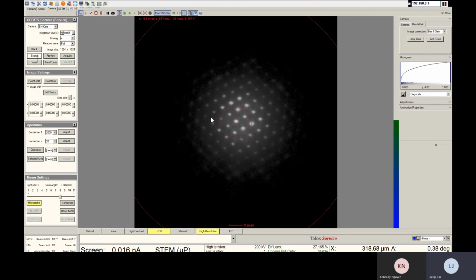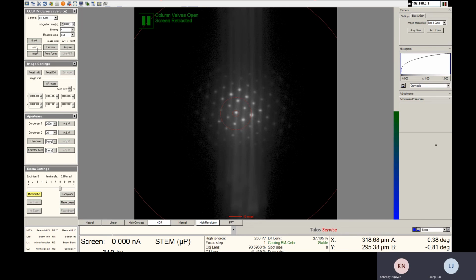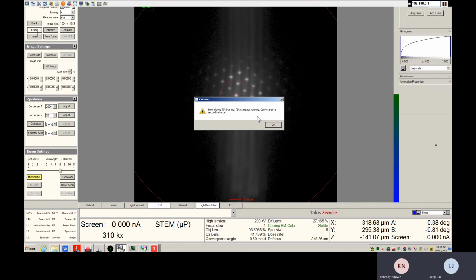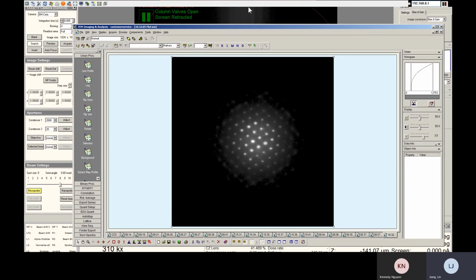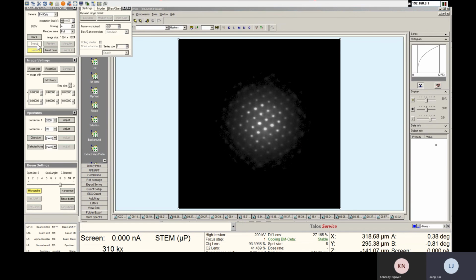So we lift the screen, and then we can bring this up. Okay. You can go here and do search.